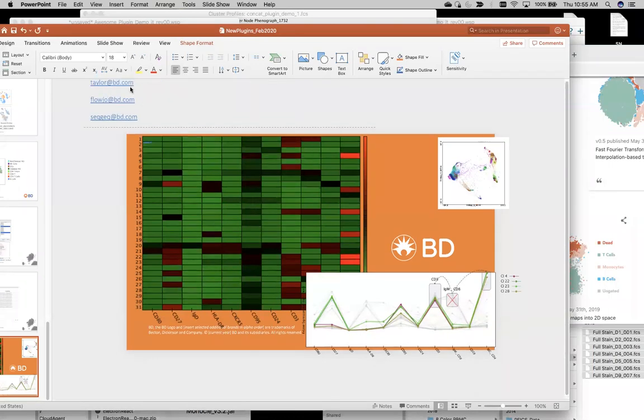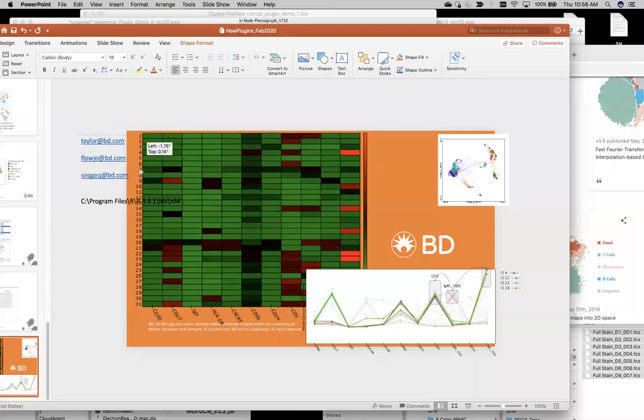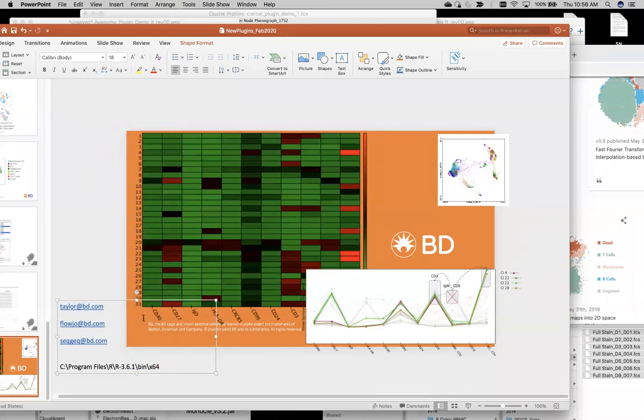It's going to be roughly something like C:\Program Files, because this is where you installed R, and then \R\ the R version, which in this case is probably 3.6.1 for most people. Then make sure you go to bin\x64. I'll copy all of this and put that into the chat, so you can copy paste that.